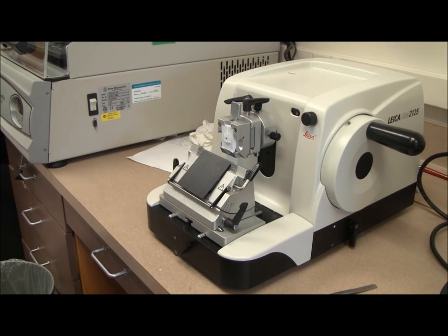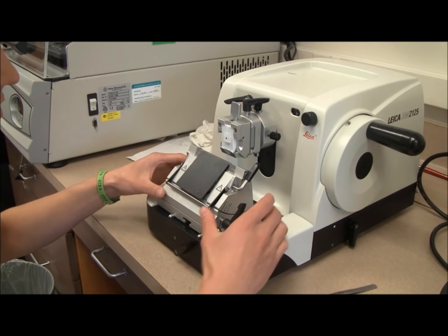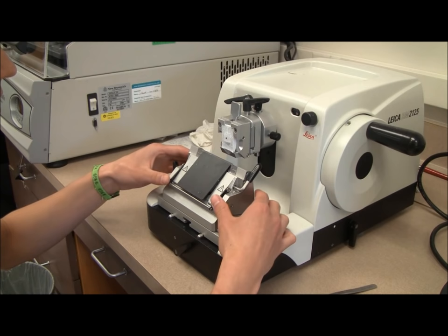The knife holder can be adjusted in three planes with the use of three different knobs. The front knob is used to move it forward and backward. The knob on the left is used for lateral adjustments and the one on the right changes the angle of the knife holder.